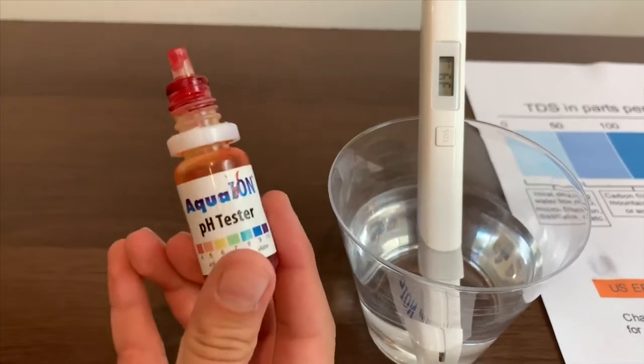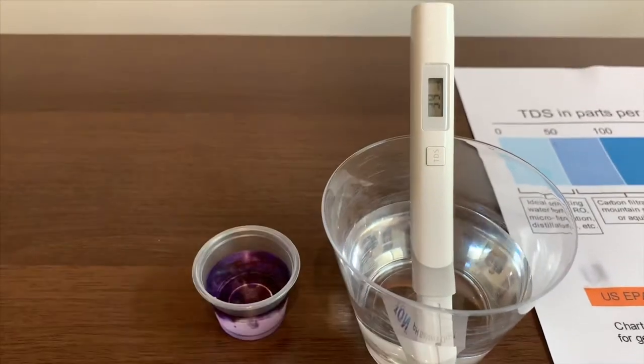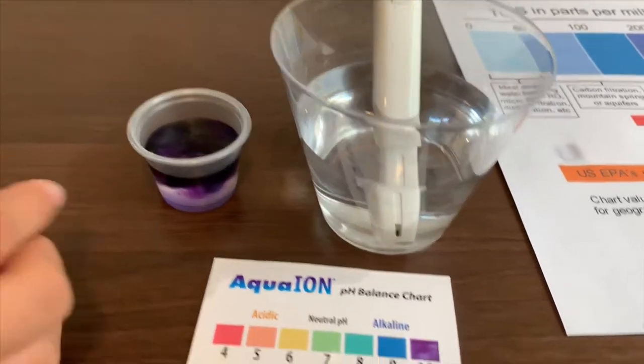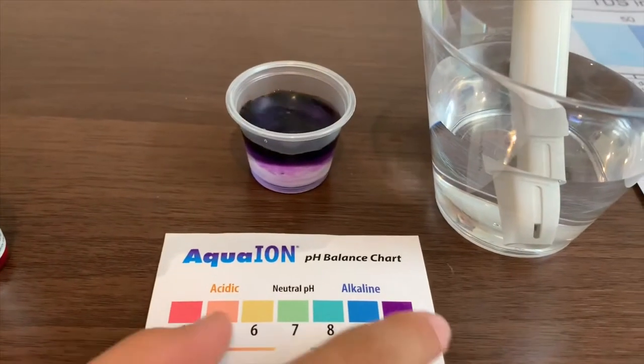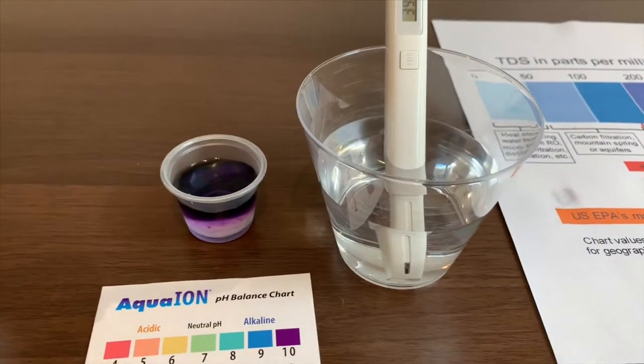Now let's test the pH level. It is 10. They are right when they say it's 10.